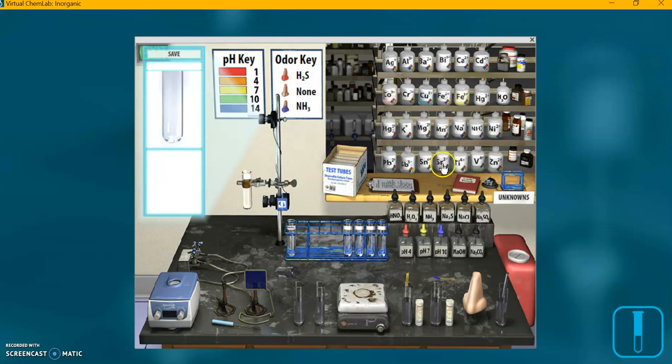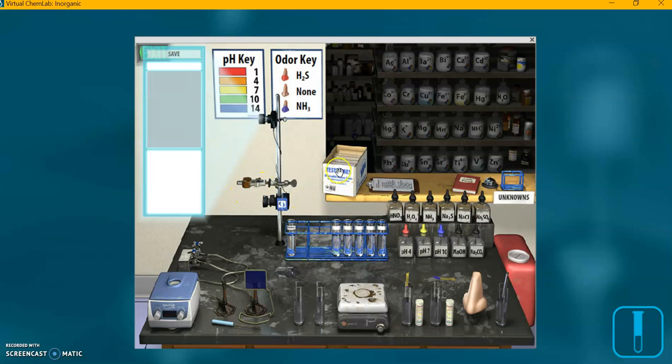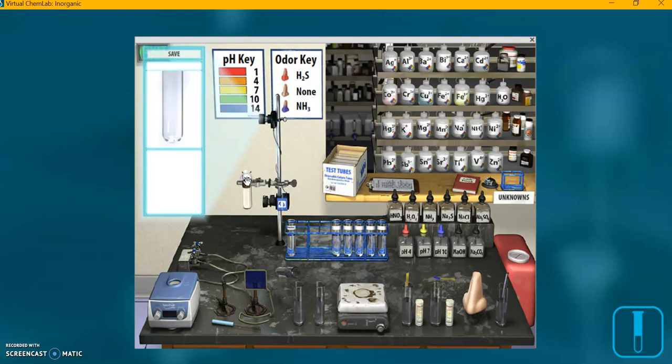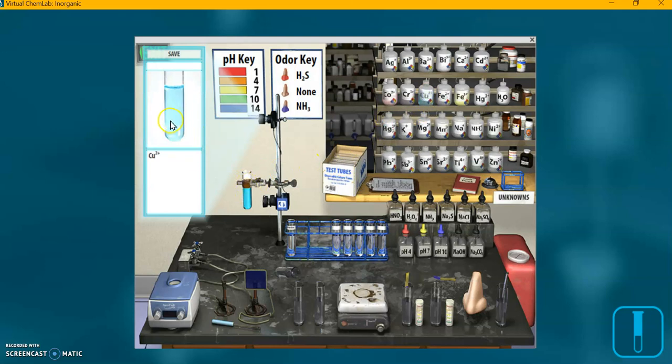Strontium. Copper. That one's blue, as copper solutions tend to be.